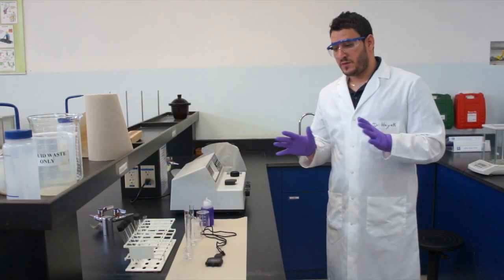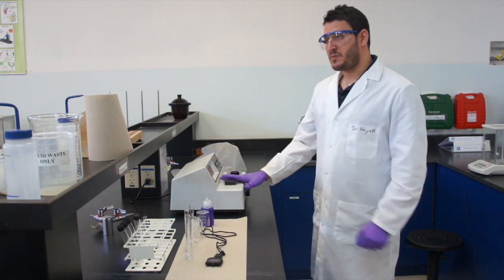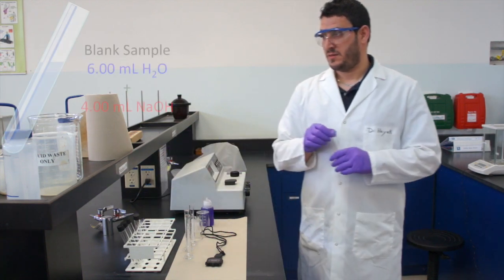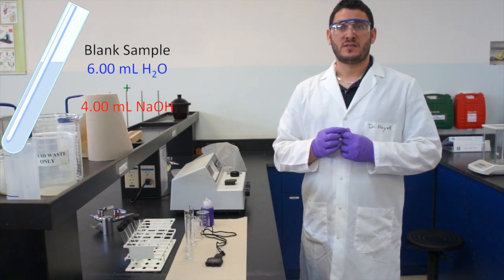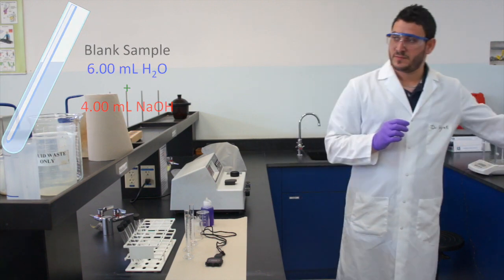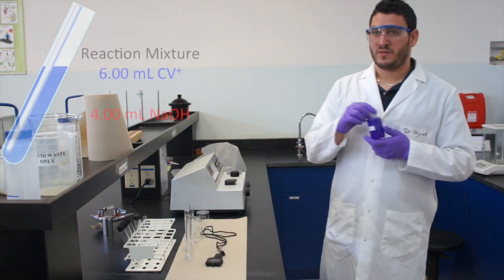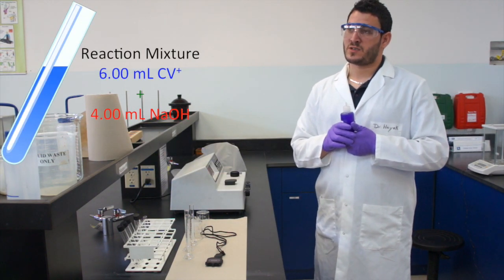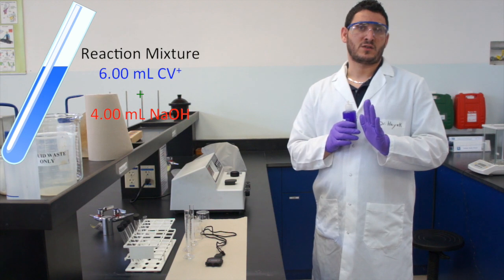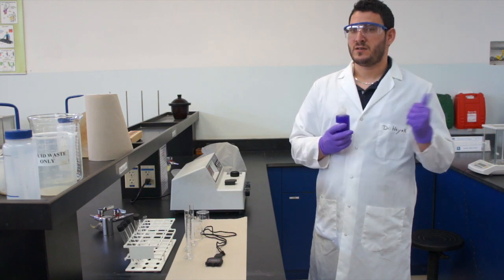Okay, now a few remarks about what you need to do when you do your experiment. The spectrophotometer, you need to calibrate it. And in order to calibrate it, you will take your blank, okay? You will use 6 milliliters of water and 4 milliliters of sodium hydroxide, okay? The reason is that for your reaction between CV plus, crystal violet, and sodium hydroxide, you will be using 6 milliliters of CV plus and 4 milliliters of NaOH, okay? So for the blank, you substitute the CV plus by distilled water.